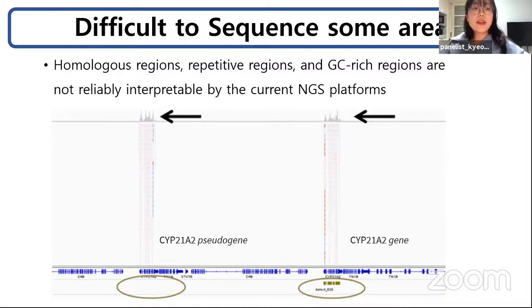Fragments of DNA that are sequenced from the target gene and homologous regions may be so similar in sequence as to be indistinguishable. And the shorter the length of sequence, the more likely this is to occur. So fragments of DNA from a target gene and homologous regions will have poor mapping quality, and reads belonging to the homolog can be mismapped to the real gene.